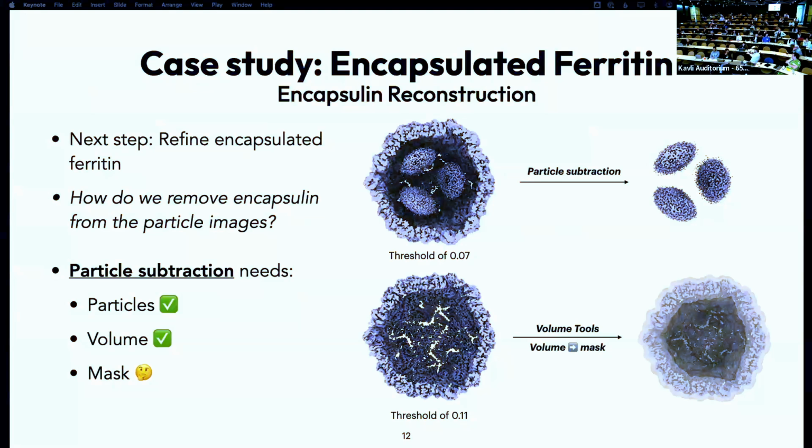So we never throw away the information about which of those 4 cargo pieces is where inside the shell. And so that means the prior is actually very strong.